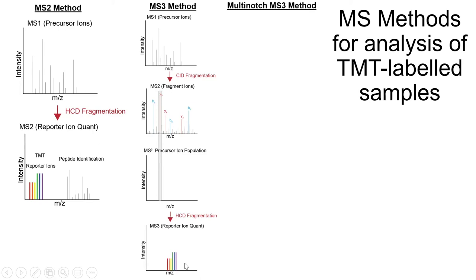So one reason you would do this is, like Dr. Dowd talked about, for this MS1 to MS2 step, or for MS2, you're selecting a population for fragmentation, so you have that isolation window. And with that window, you're never going to probably select just the ion you want. And so you have some background that can complicate your quantitation. And so by adding in another selection step, you weed out some of that extra background to get better quantitation with lower background.